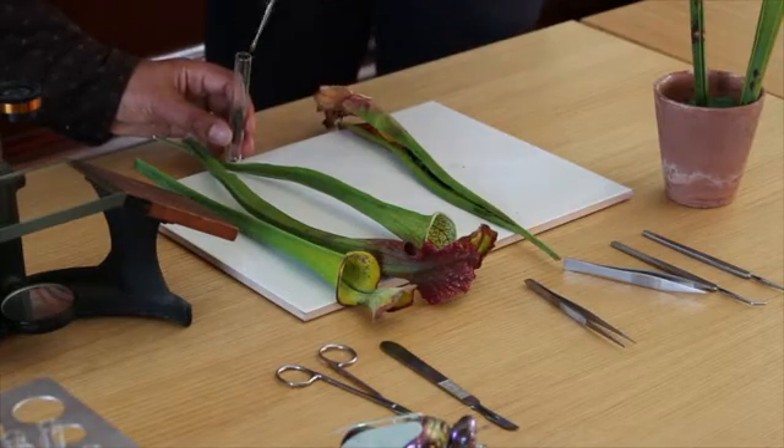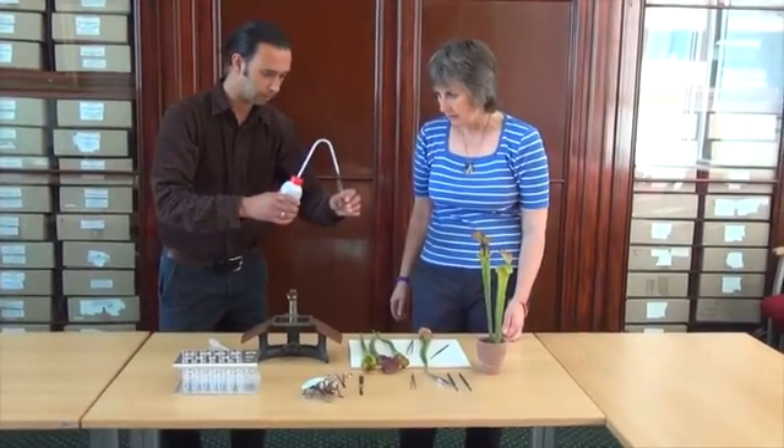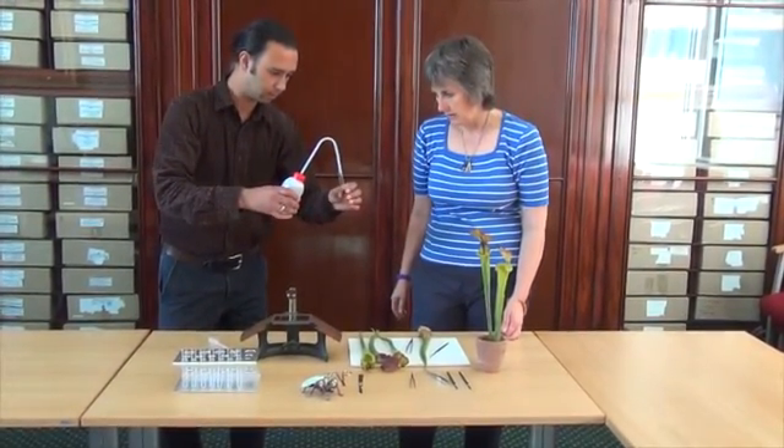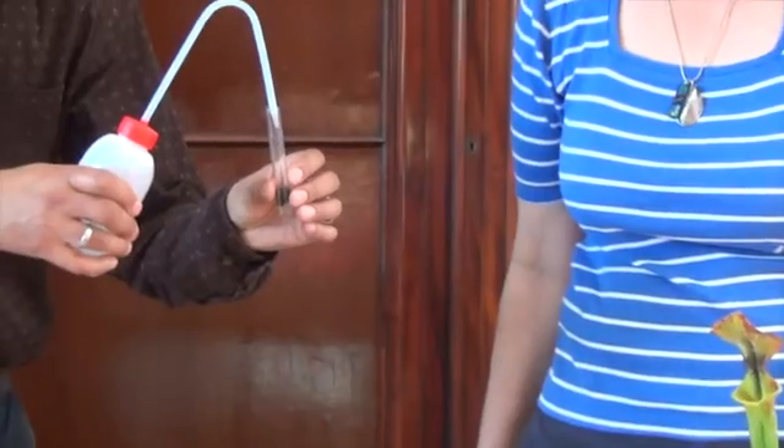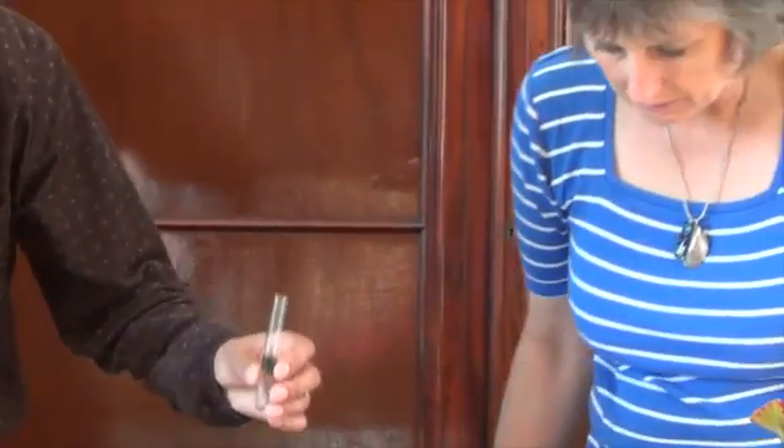What we're going to do is actually rehydrate the bodies. We'll fill it halfway up — that would be great — and then we'll take some more.